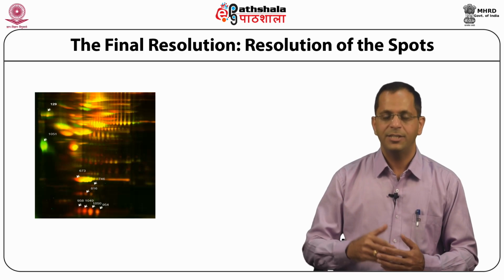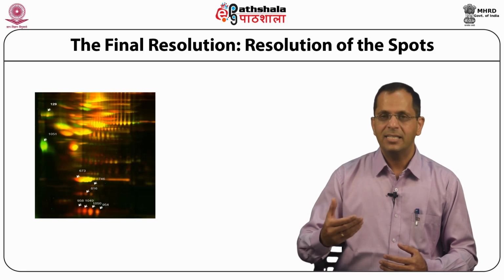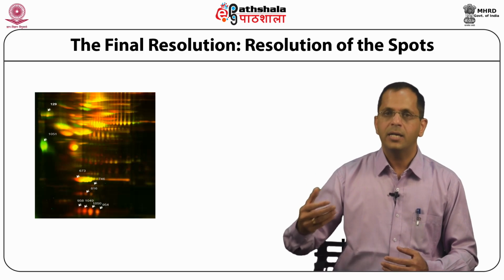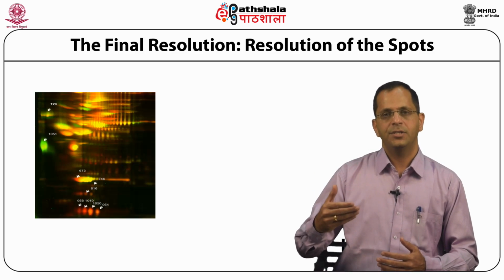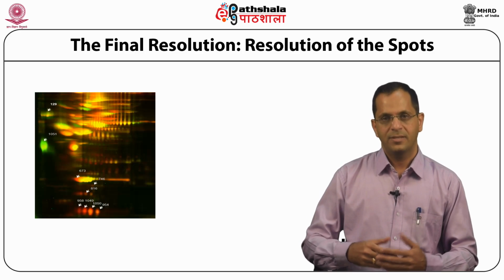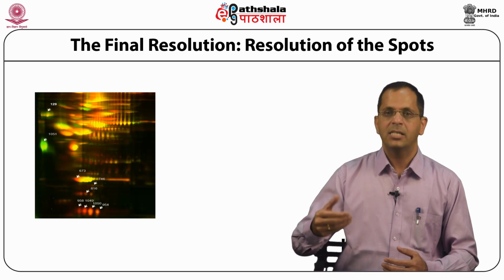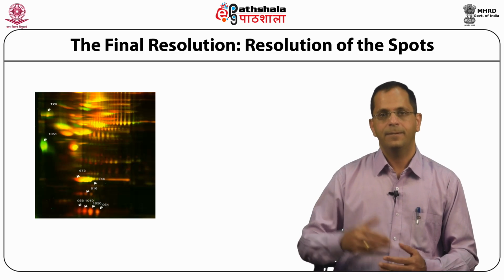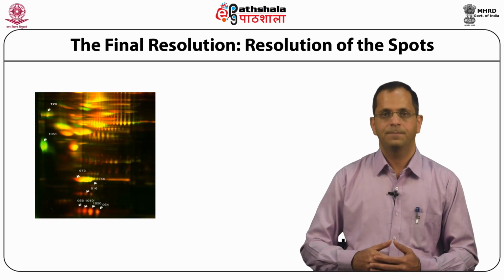What are these advantages? One, a better differential analysis, which would be required for either biomarker discovery or identification of a drug target. Second, you would have a better mass spec analysis of the identified protein. There are lesser chances of false positives.